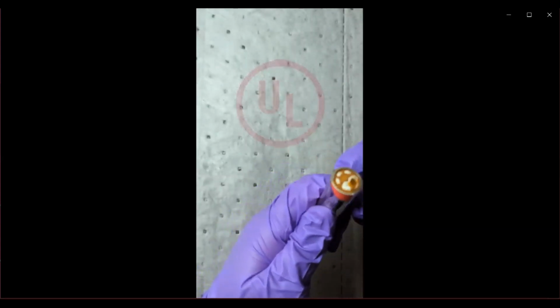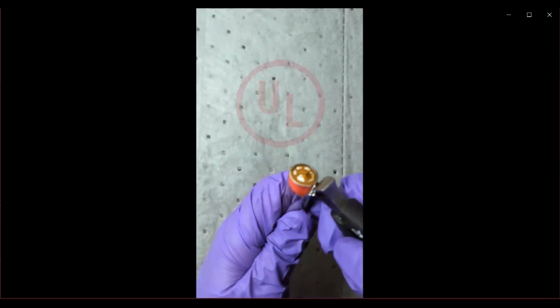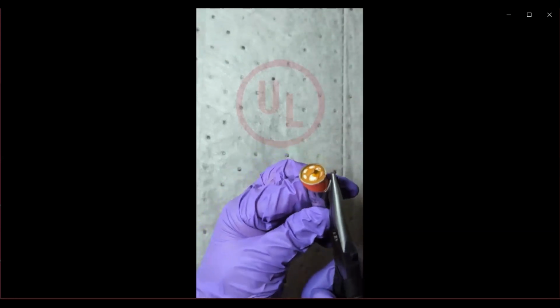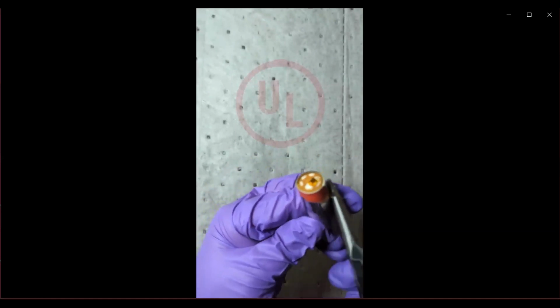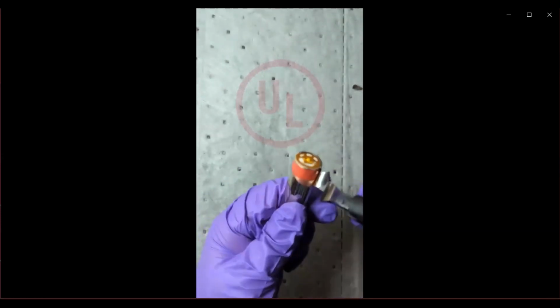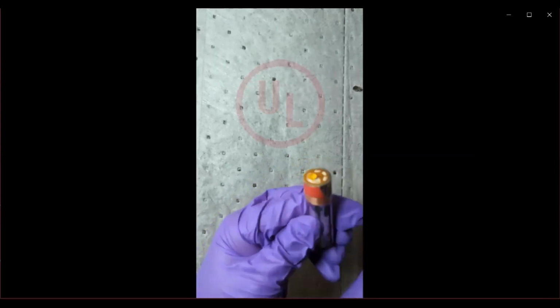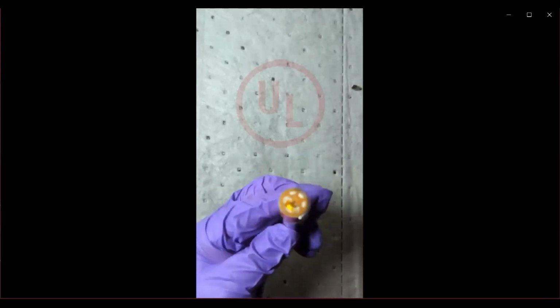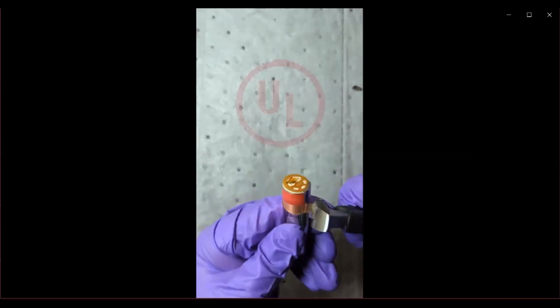Again, caution should be exercised while doing this, because if you cause any deformation of the electrode stack, since there is still wet electrolyte and the electrodes are all present along with the wet electrolyte, you can cause heat to build up due to internal short circuits that can occur due to the deformation or compression. So whether you're working with the Dremel tool and scoring the can, or using the metal cutter like we're doing here with the pliers to remove the metal can, either way, you just have to be very patient and go through this in a very slow manner to prevent heat buildup during the destructive analysis.